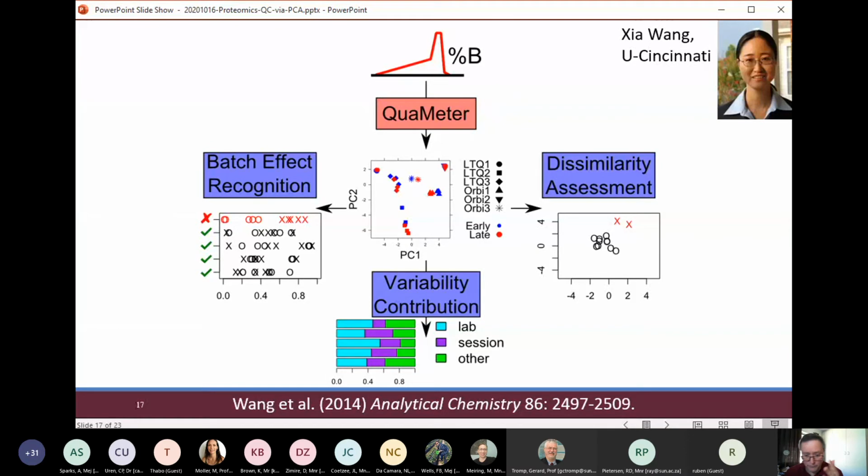I think that we're aware from the earlier part of this talk that if you simply run the same instrument on the same sample, the data will vary over time. But I want to point out that very frequently, people in proteomics fall into the trap of running their cohorts separately. And this is something that it's very hard to do anything to fix after the fact. So let us say I'm trying to put together a case control study for TB diagnosis. If I run all of my cases in June and only give my controls to them in August, you can see then that there's this period of months of time that's passed between when the first cohort was collected and when the second was collected.